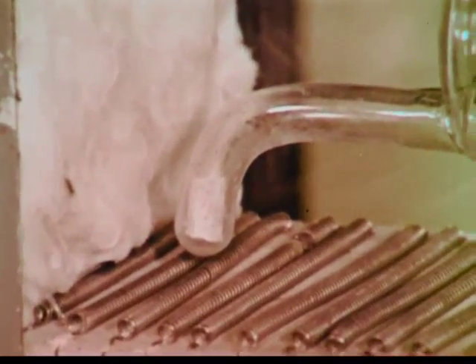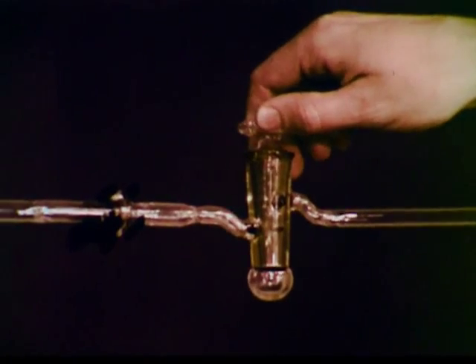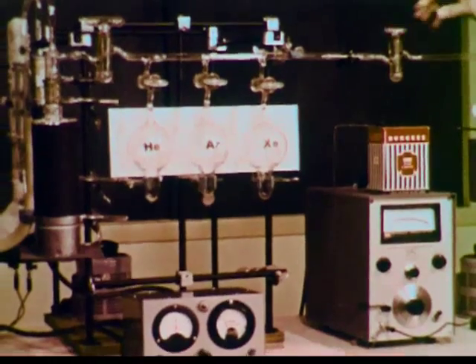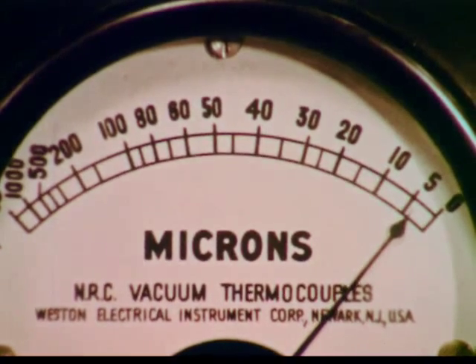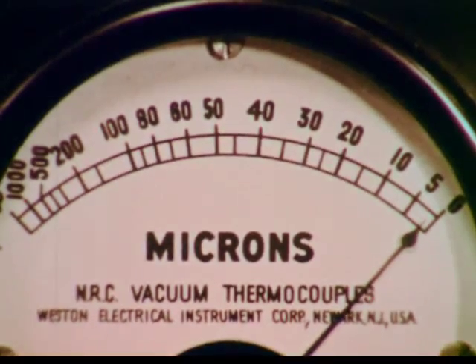There's sodium here in the sidearm of the cell, so that when the oven surrounding it heats, sodium vapor will fill the cell. In order to make our measurements on pure gaseous sodium, we must first open this stopcock and pump all the other gases from the cell. This gauge shows the pressure in the cell. For our experiment, the pressure must be less than 1 micron, less than a millionth of an atmosphere.